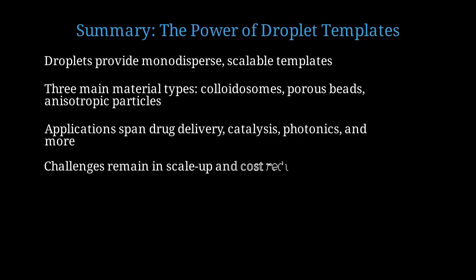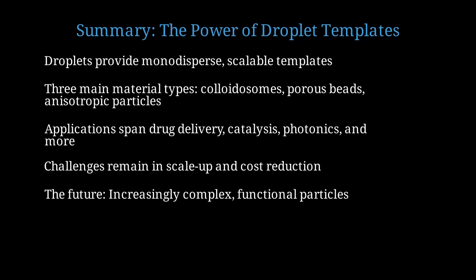While challenges remain in scale-up and cost reduction, ongoing advances in manufacturing, automation, and process integration are steadily expanding the technology's reach. The future promises increasingly complex and functional particles with multiple compartments, responsive behaviors, and precisely programmed assembly properties. Droplet templating is poised to enable the next generation of advanced materials.